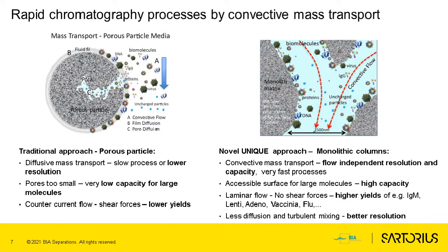So we would have no diffusivity constraints in such a chromatographic support, neither shear forces, because the channels would allow for laminar flow, which means no shears, no eddies. And secondly, we have no dead-end pore, which means the mass transport between stationary and mobile phase is instant. So we can speed our processes to be really extremely fast. The equipment is actually the limiting factor here.